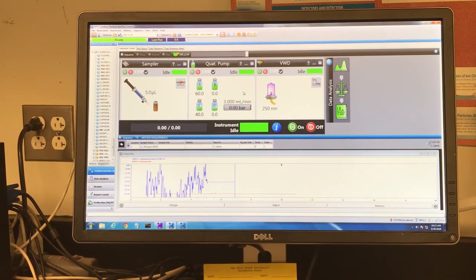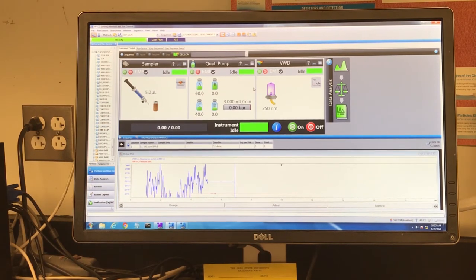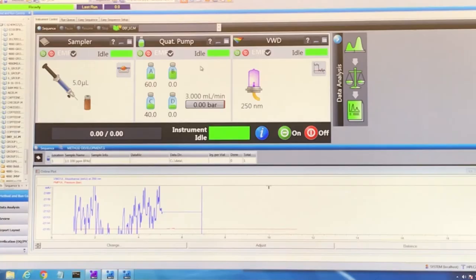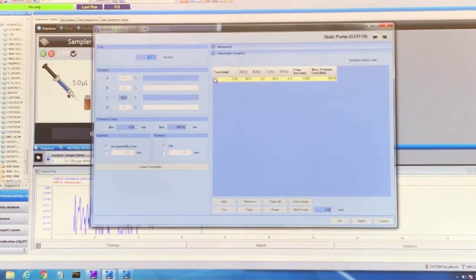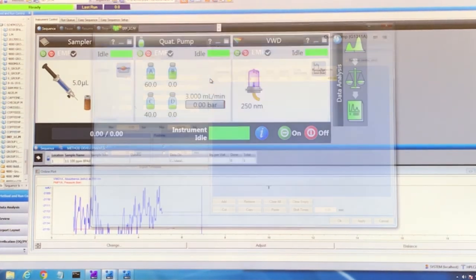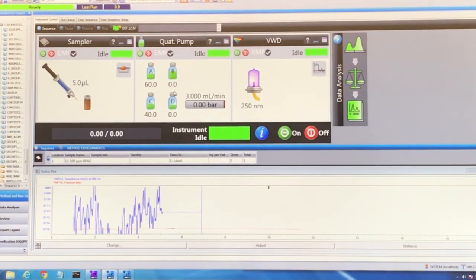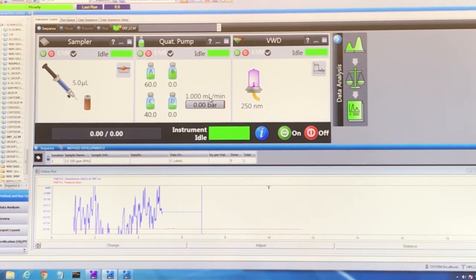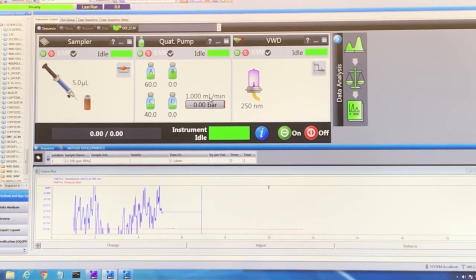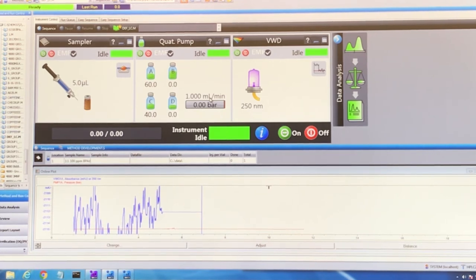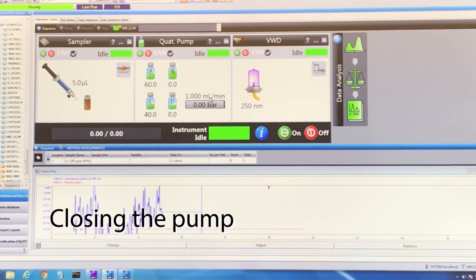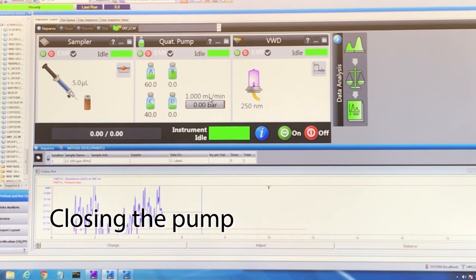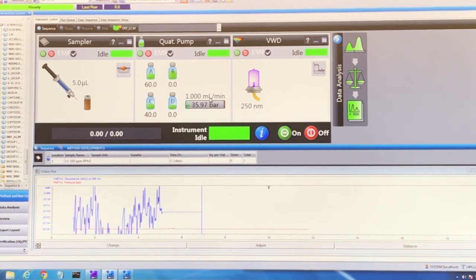We've been purging for a while now. It's a good idea to purge for about 20 minutes. Before I close down the purge valve, I'm going to switch my method back to only delivering 1 milliliter per minute of flow. You should hear the quaternary pump change - it won't be clicking as fast. Now I can go ahead and close the purge valve. Not too tight, just by hand, tight enough.